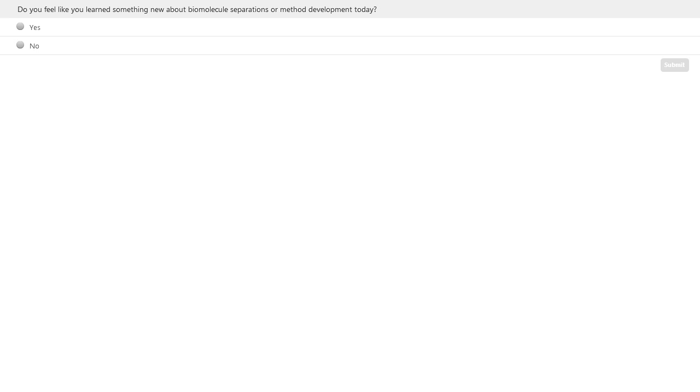Okay, great. Next question, what are some strategies to minimize the carryover of large proteins? That's a very good question. And actually, I did have a slide on carryover in my original slide set, but it was obviously too long already, so I took that one out. Carryover is a right pain, to be honest, when it comes to proteins. You need to try and work out where it's sticking. Some columns it will stick to. Sometimes it will stick to the stainless steel. Sometimes it's very hard to work out where your protein is sticking on the system.